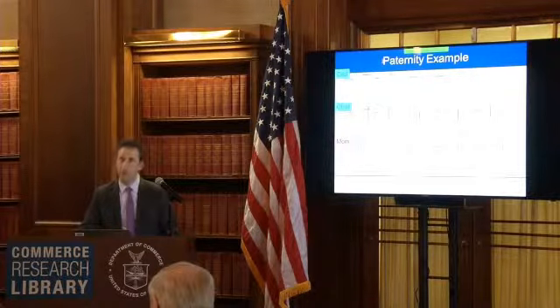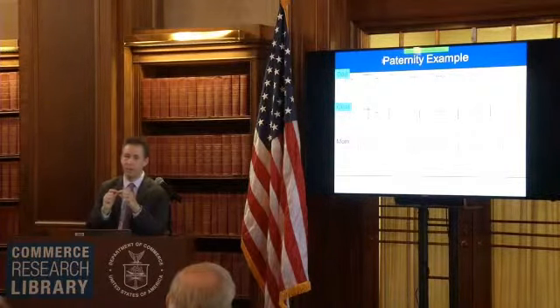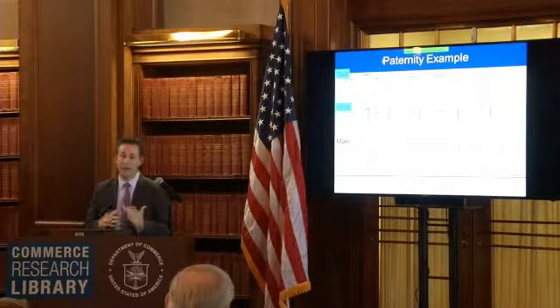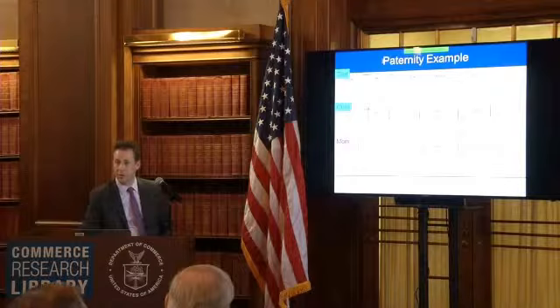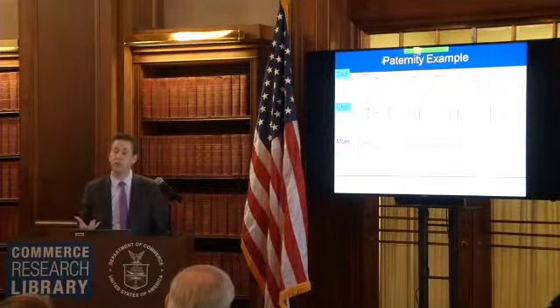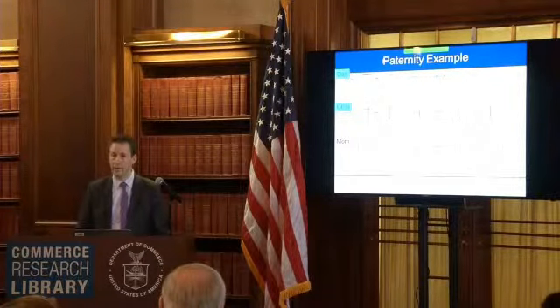There's also an artifact called stutter. So when you have a 12 allele, or any allele size, usually you have a very small peak that might be like 5%, because when that polymerase chain reaction happens, that has a little bit of error too. So you could see all these sort of have that, where the 18, this is at 17 right here. You have a little bit of that. I'm not going to get into it, but there are interpretation thresholds. So things below a certain level, you do a validation, and so you know what your signal to noise ratio should be and whether to count something or not count something. But yeah.